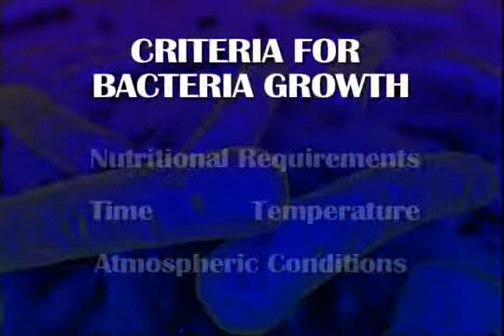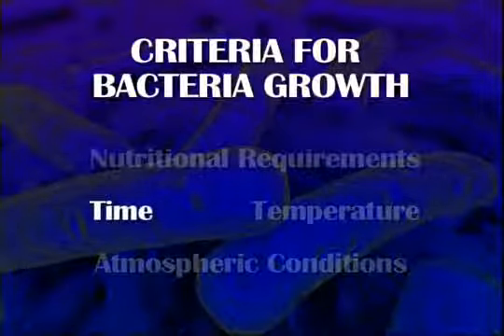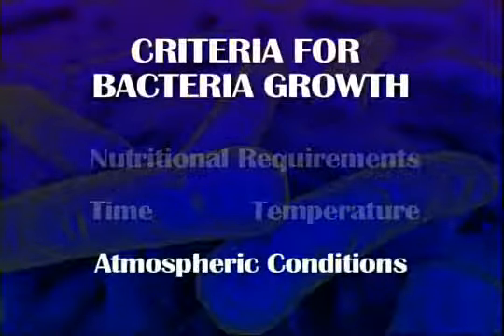In order to grow bacteria, there are 4 criteria that we have to look out for or take care of. One is the nutritional requirements of bacteria. The second is the time requirement for growth. The third is the temperature requirement. And the fourth is the atmospheric requirement.